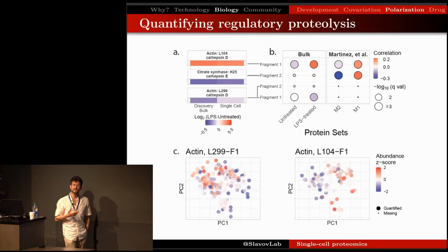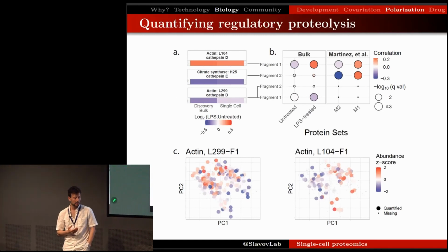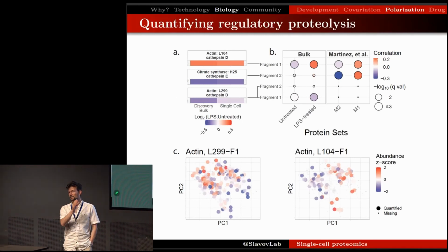And furthermore, with this prioritized approach that we developed in collaboration with the Cox group, with Christoph, we are now able to prioritize proteolytically cleaved peptides, and one could use this for other post-translationally modified peptides. We first validated this using standard assays for measuring proteolytically cleaved proteins, in bulk.